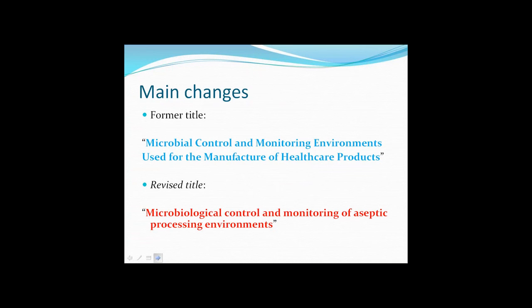So this creates a clear and intentional sterile and non-sterile distinction. So the retitled USP chapter is Microbiological Control and Monitoring of Aseptic Processing Environments.